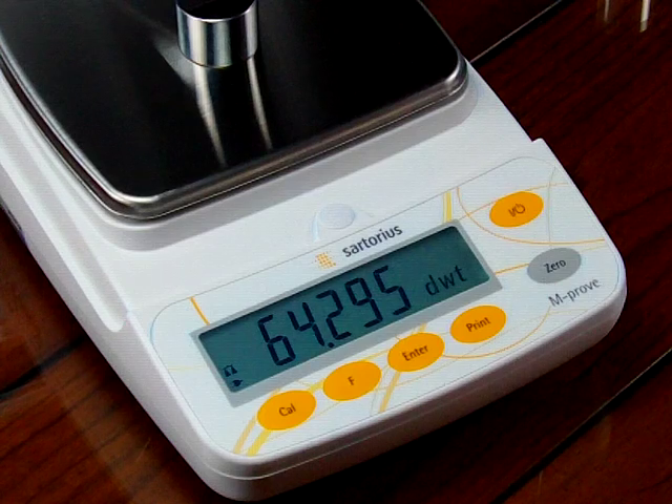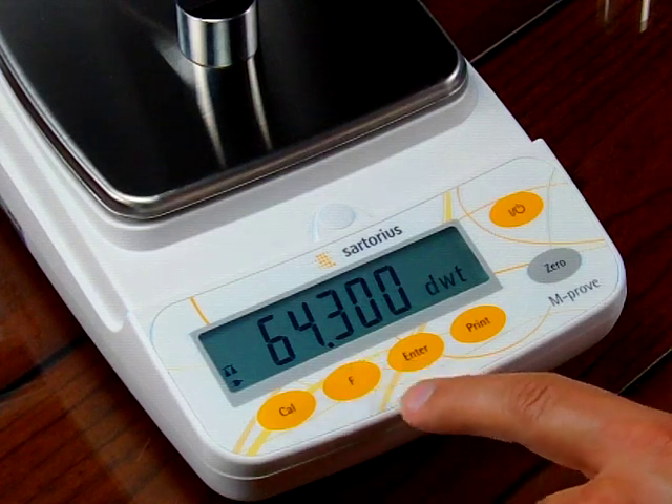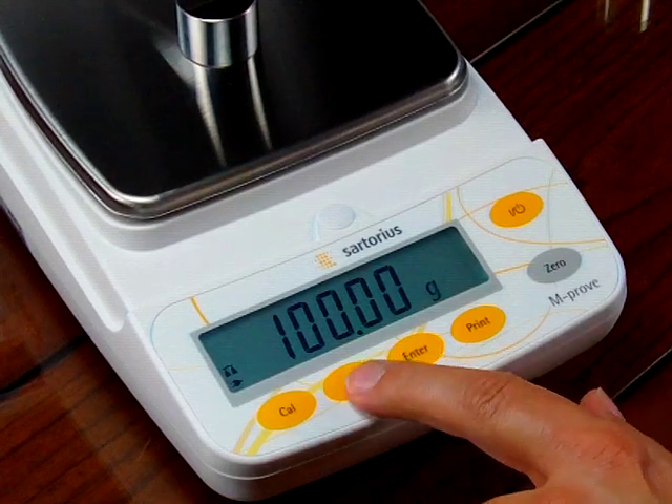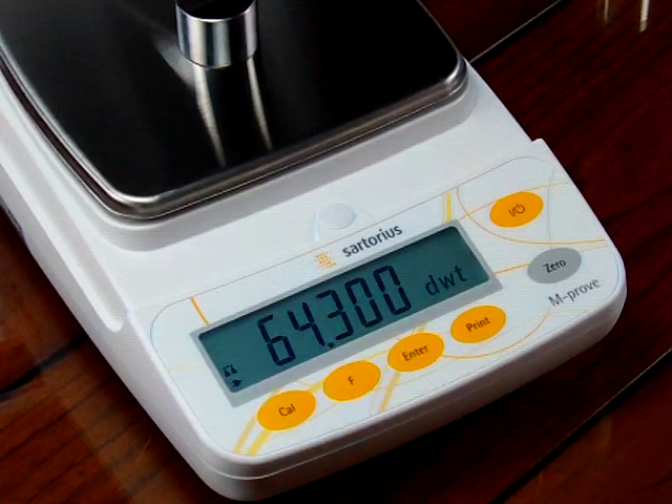To change the weigh mode, all I have to do is hit the F key — now I'm in grams. To toggle back, I go to penny weight.